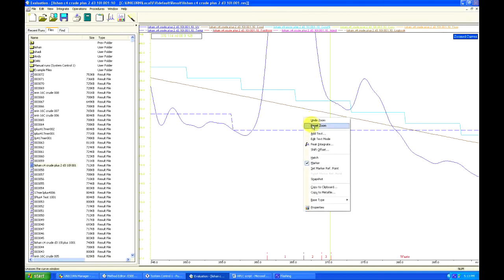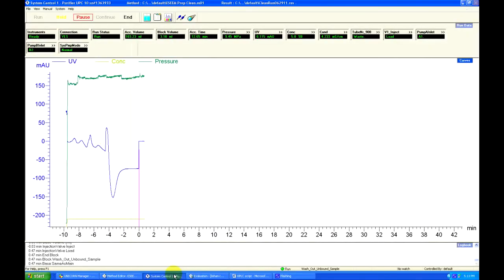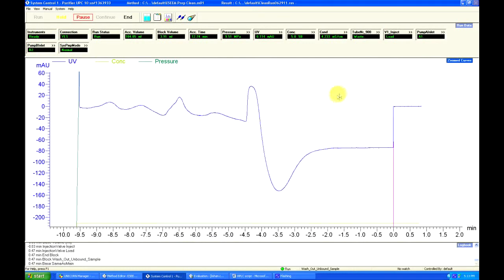Right-click and reset zoom resets the zoom, or undo zoom if you want to undo the previous zoom, but not reset the whole thing. This nifty zoom function and the marker are also available in the system control window, so you can actually look at the peaks close up while they're eluting, as well as analyze what %B they're eluting at.